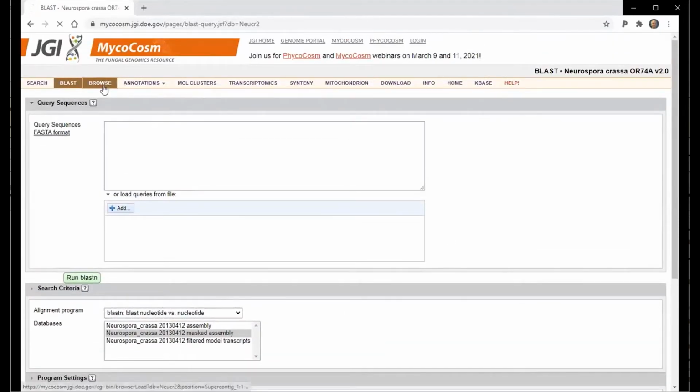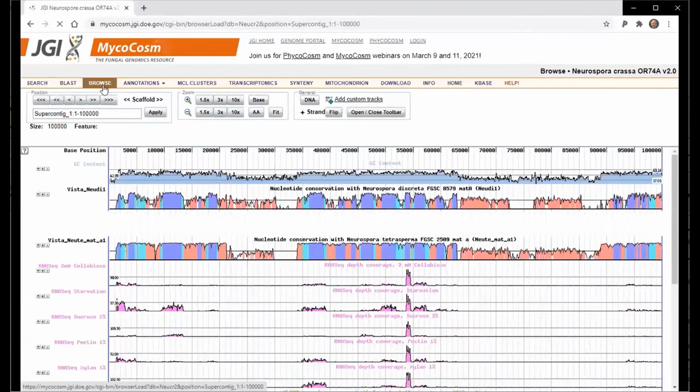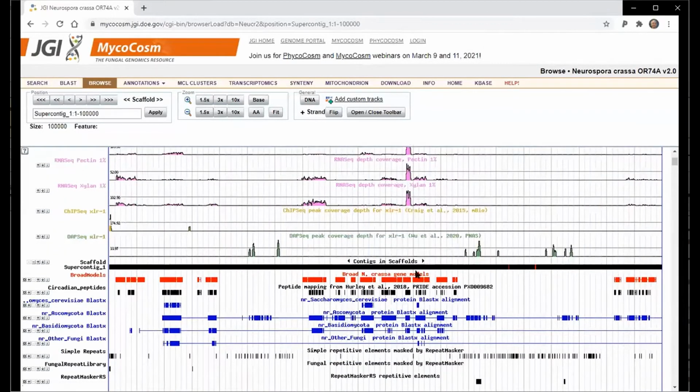The other useful way to find things is through the Genome browser. Our Genome browser is based on the UCSC gbrowse infrastructure and presents a scaffold-level view of gene organization. The browser view shows where features like predicted gene models, repeats, and aligned features are positioned along each scaffold. Near the top are our common curve tracks representing GC percentage and genome alignments against related species. Below the scaffold, represented by this black bar, are the collection of feature tracks.